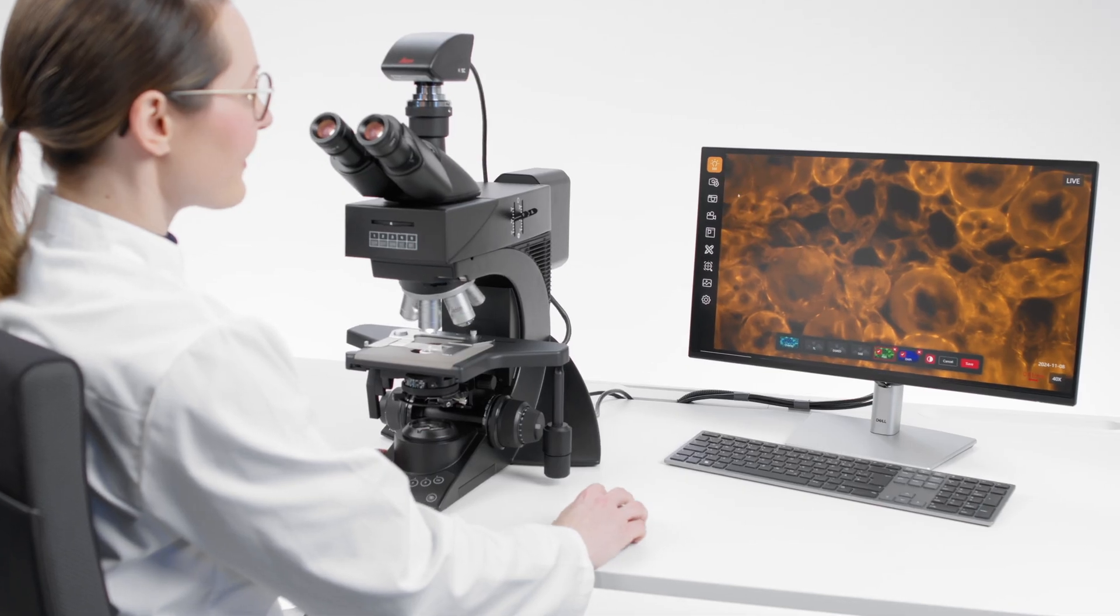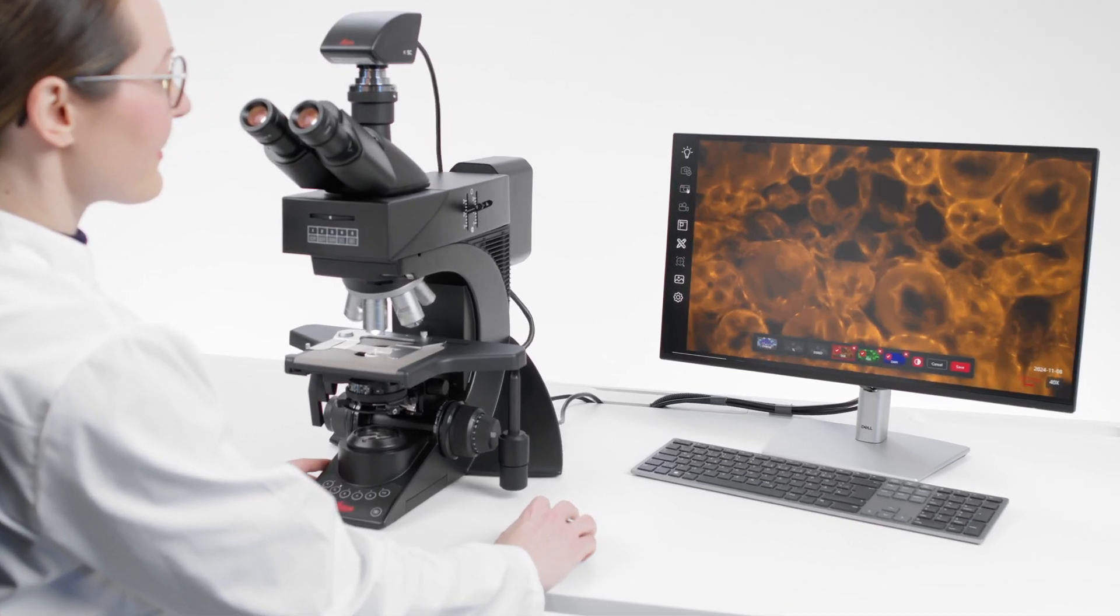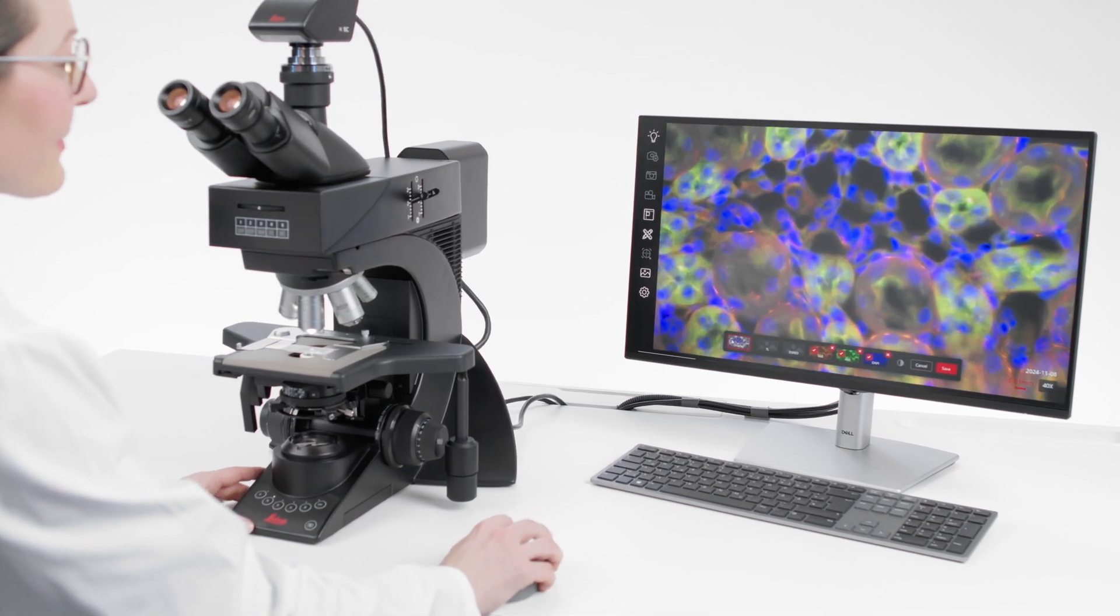Reveal sub-cellular structures in tissues and specimens efficiently using fluorescence.